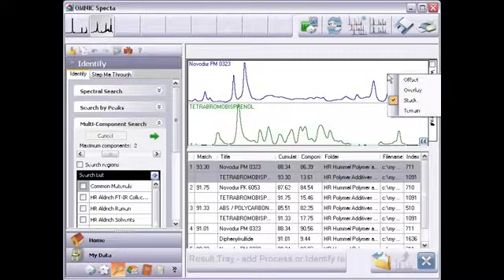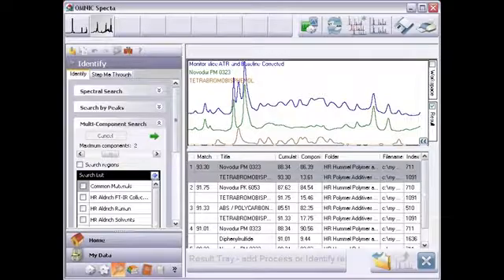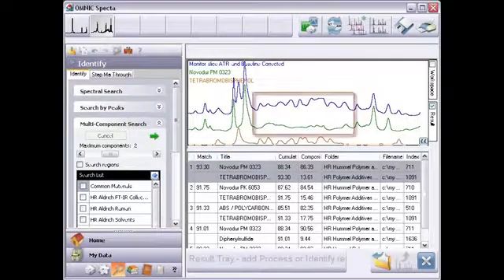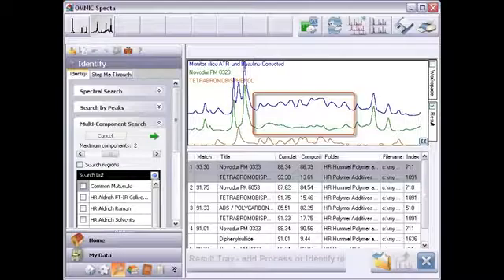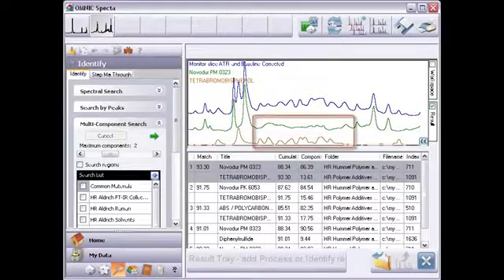If you change the middle section to offset mode, you can see that the first reference in the set, the base plastic, is missing all these peaks in the middle range. The second material clearly contributes here.